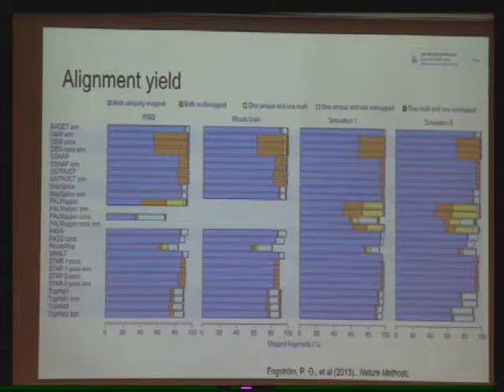So right away, you can notice a few differences. There are a few groups of software that all get about the same level of unique alignment, up here. There's quite a few that are getting high, and then there's some that are down, much lower. And you can look over here, those trends are pretty consistent.